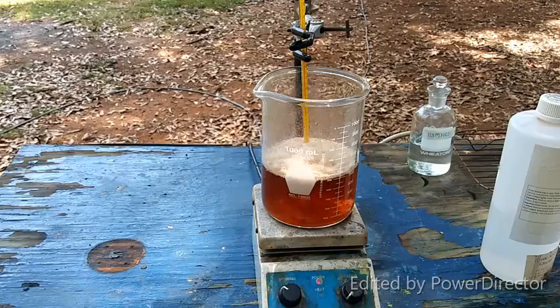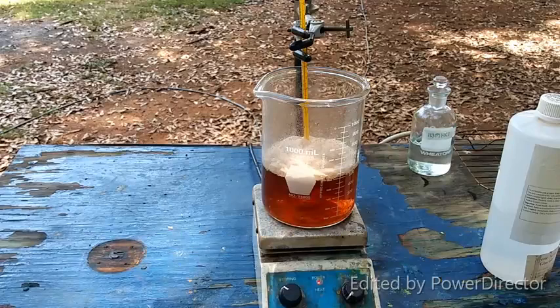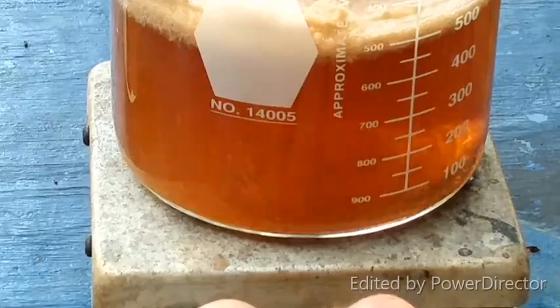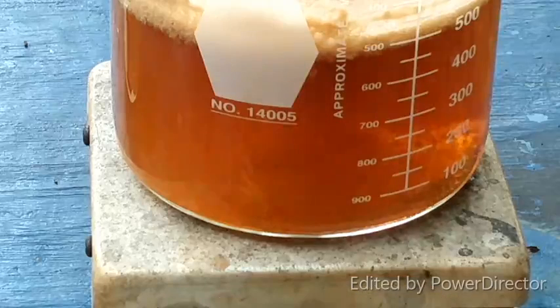Now that's interesting. I should note that it doesn't look like the temperature's going up significantly. Oh yeah. Okay, it is happening, people. Anthranilic acid is beginning to precipitate.